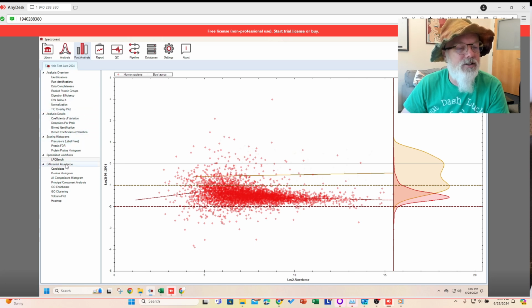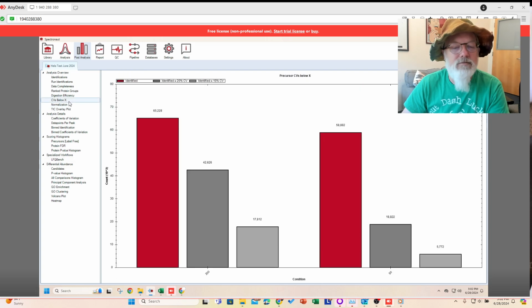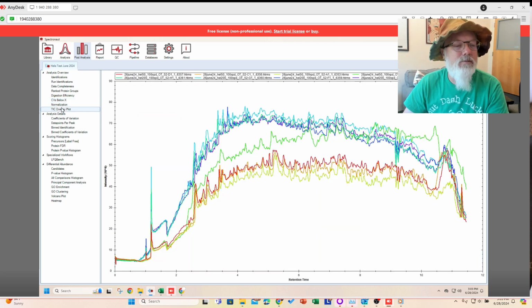Most of the other new features are within the PTM workflow, so I will try to show you that later. And you can see I'm getting better results with the 200s. So the closer these bars are to each other, the better. Usually people like to look at things that are under 20% CVs. My CVs would be better if this one worked well. Why that is, I don't know. I chalk it up to pipetting errors.